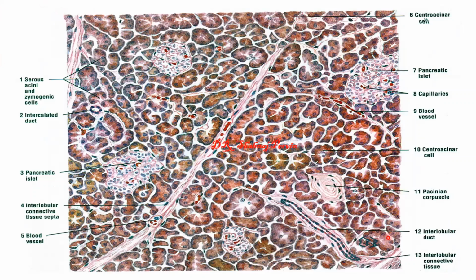So you see, this is the histological structure, histological section of a pancreas. Outer capsule is there. From the capsule send the septum and divide into different lobes and lobules. Each lobe contains exocrine part and endocrine part. So all these are the same color one we are seeing. These are the exocrine acini. Exocrine part composed of the exocrine pancreatic acini, and these are the endocrine part, islets of Langerhans.